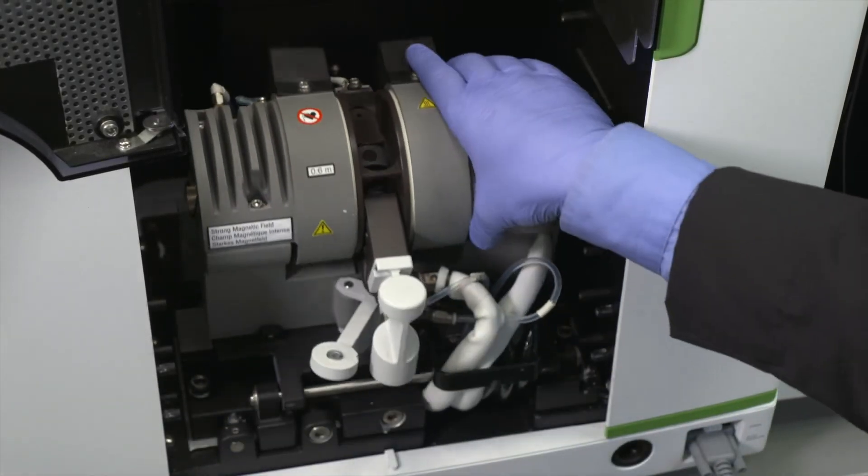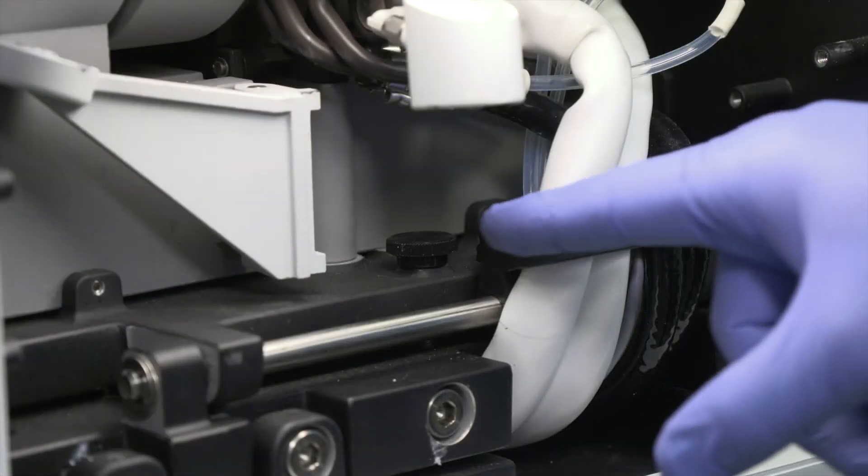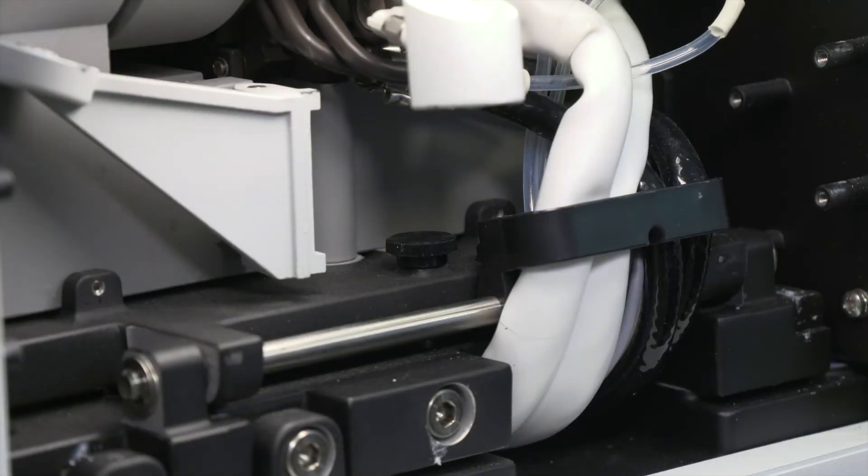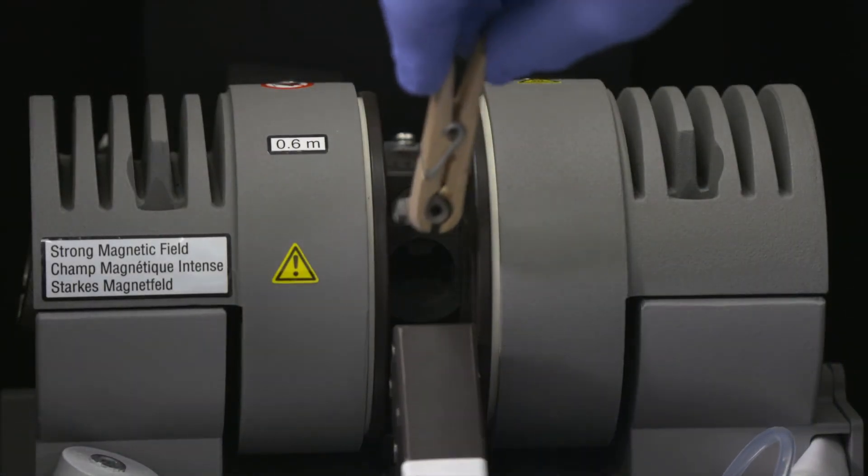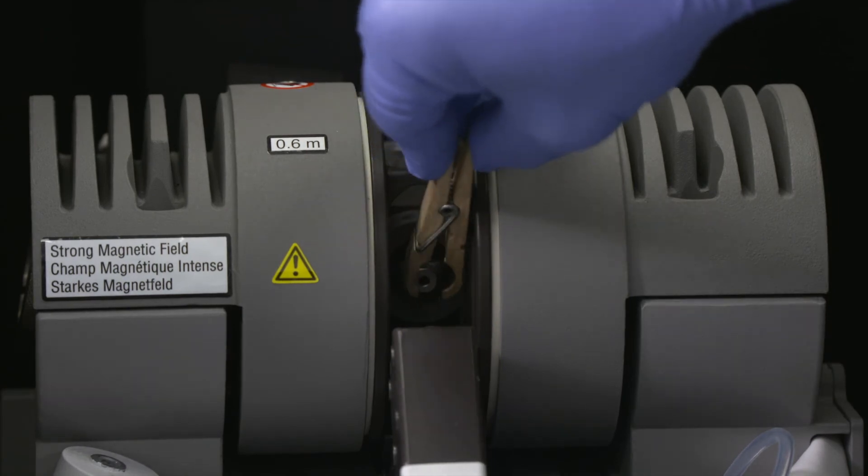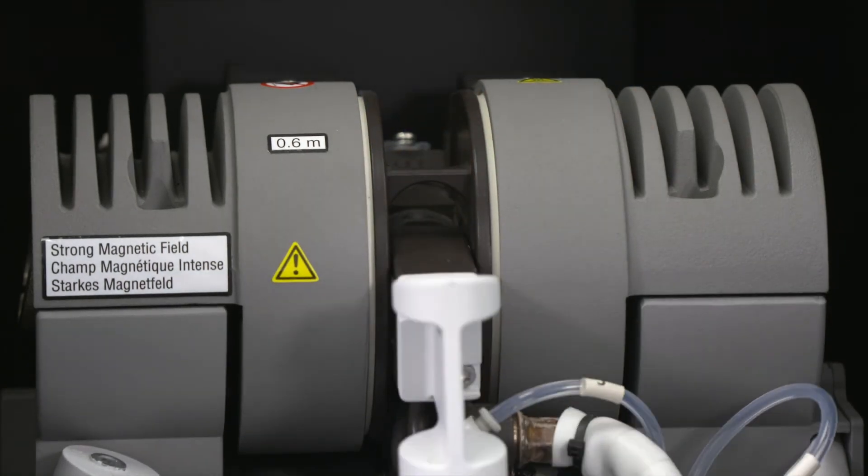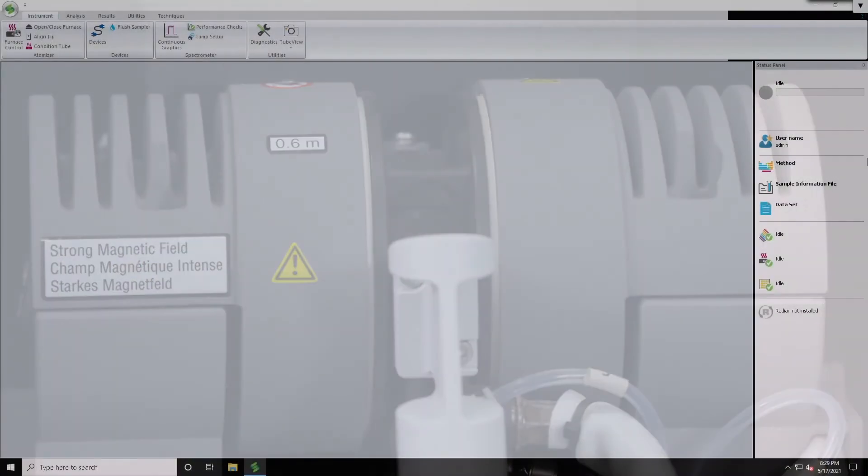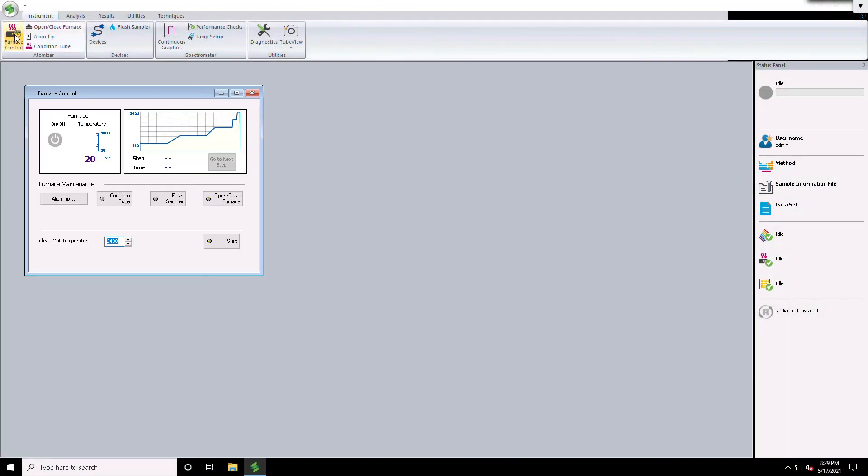Tilt the furnace back to the original position. Tighten the furnace locking screw to lock the furnace into place. Insert a graphite tube into the furnace. Close the front contact housing and swing the support lever under the contact housing. Now your contact cylinders have been replaced. Ensure that you run a tube conditioning step prior to using the system again.